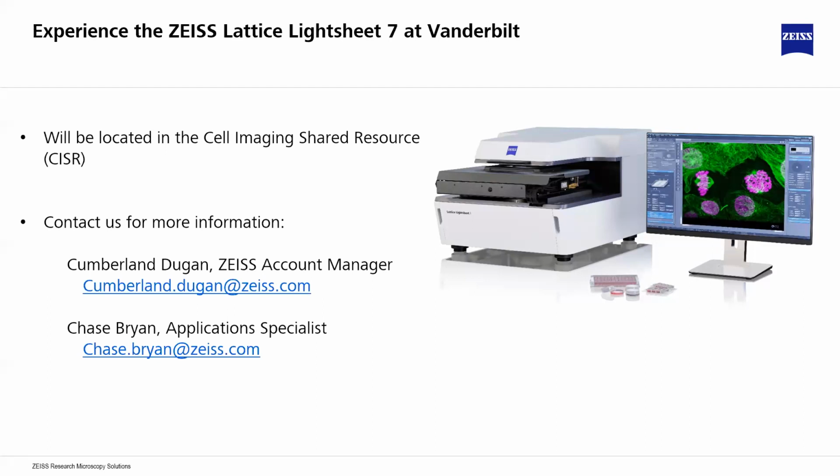So you mentioned voxel resampling happens on the fly. We can, so there's a direct processing pipeline that we can send your data through to do the voxel resampling as the data comes through, or you can reprocess the data at the end and deconvolve if you want to. Yes, you can deskew, you can deconvolve. Deconvolution does take more time, obviously, because there's a lot of data that this system can generate, and it will take time to reconstruct that data. But yeah, we can do this on the fly or as a post-processing step as well.